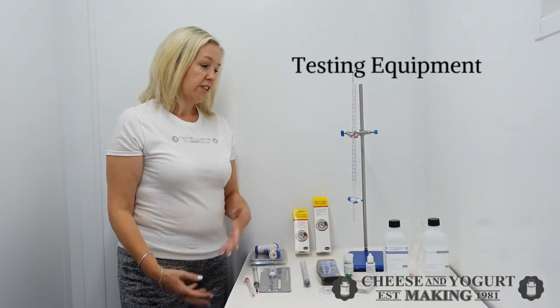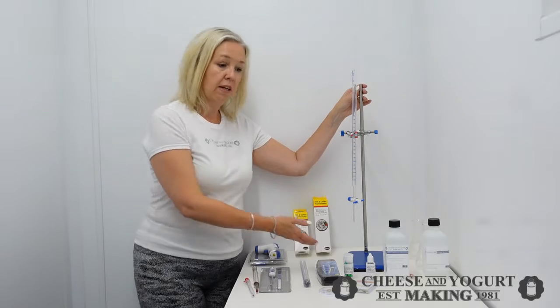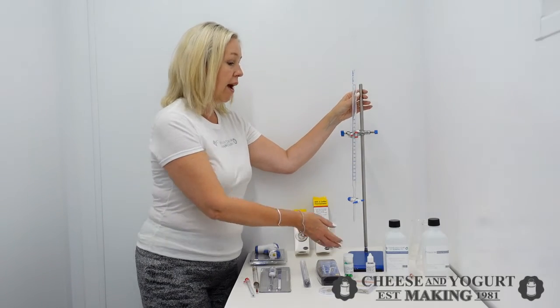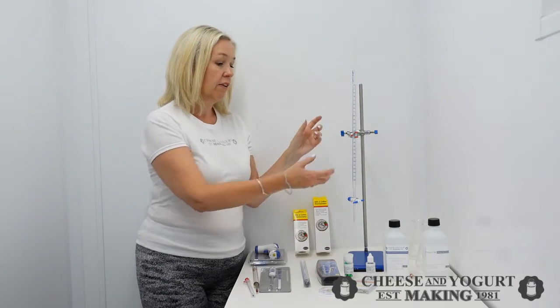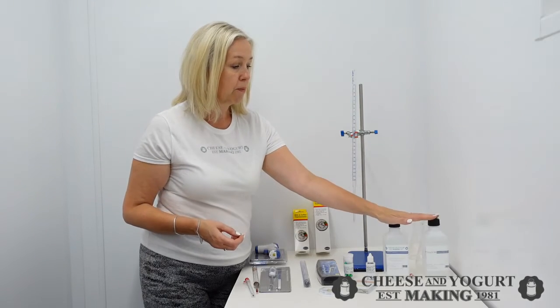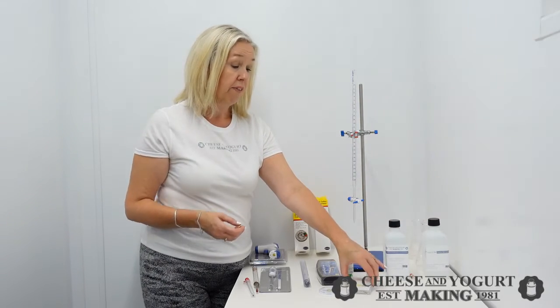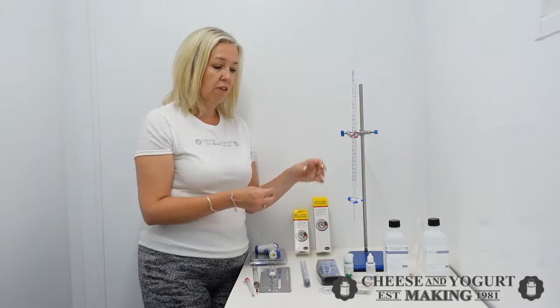Hi, this is Lynne at Cheese and Yoghurt, and this is our range of testing equipment. We'll start with this — the acidometer kit. This is the gold standard in acid testing. The complete kit is available here, as you can see, and the consumables are available as refills on the website. These are obviously for the advanced cheesemaker.